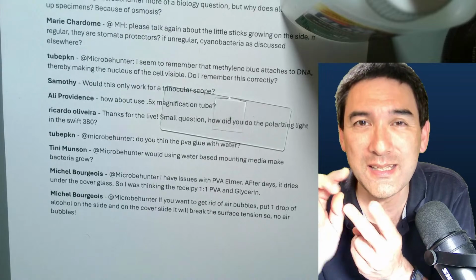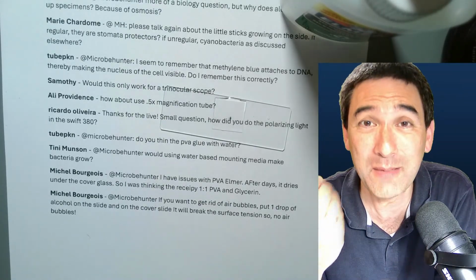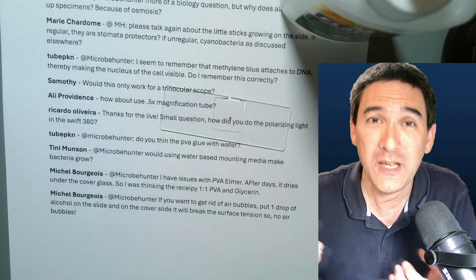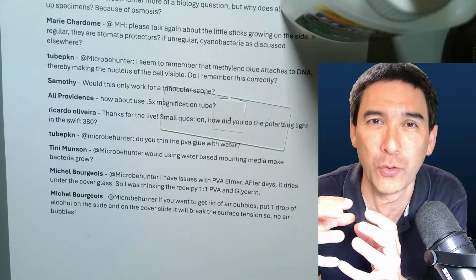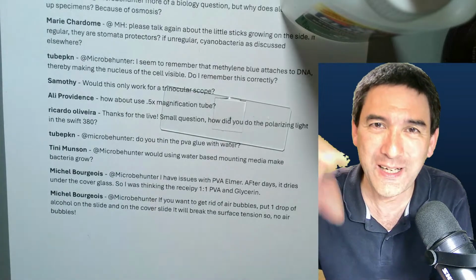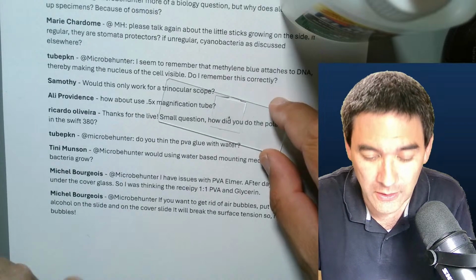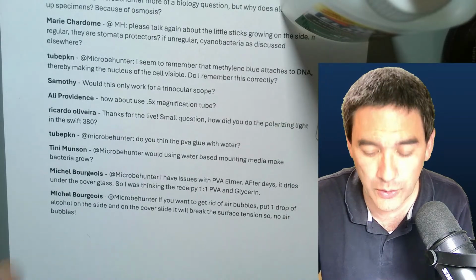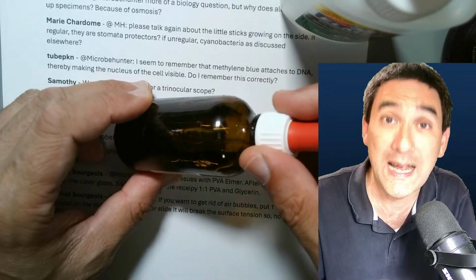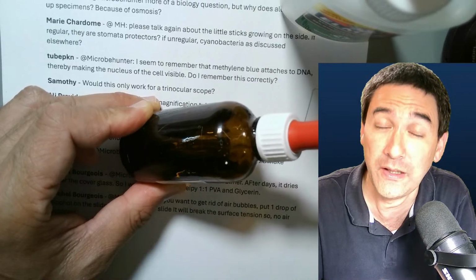But I think a second factor might be that the dissolved gases that can be found in water cannot be kept anymore if you add alcohol. This pushes out the gases, and that's why you have bubbles forming. You can sometimes see this even under the microscope: you add water and alcohol, and then you see bubbles forming all over the place. Somebody also mentioned another option: if you have a mounting medium like this, you can try to apply a vacuum, because it will draw some of the dissolved air and gases out of the liquid.